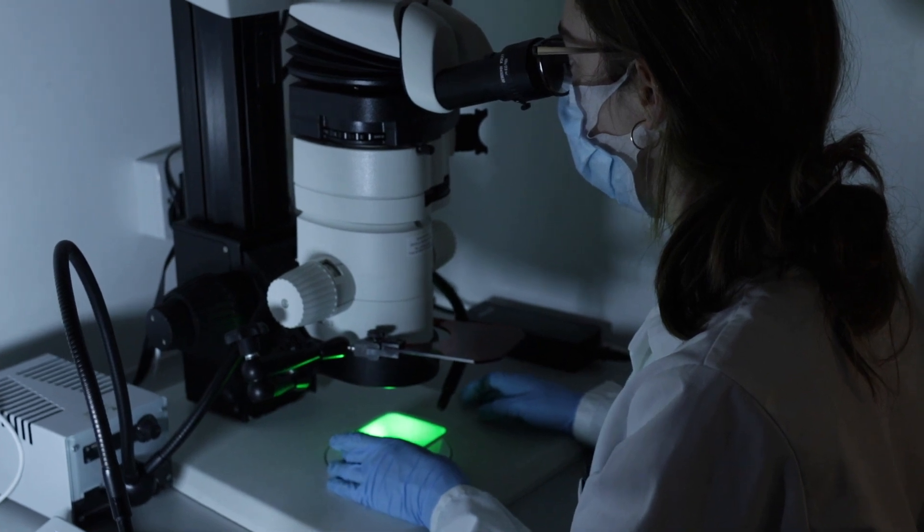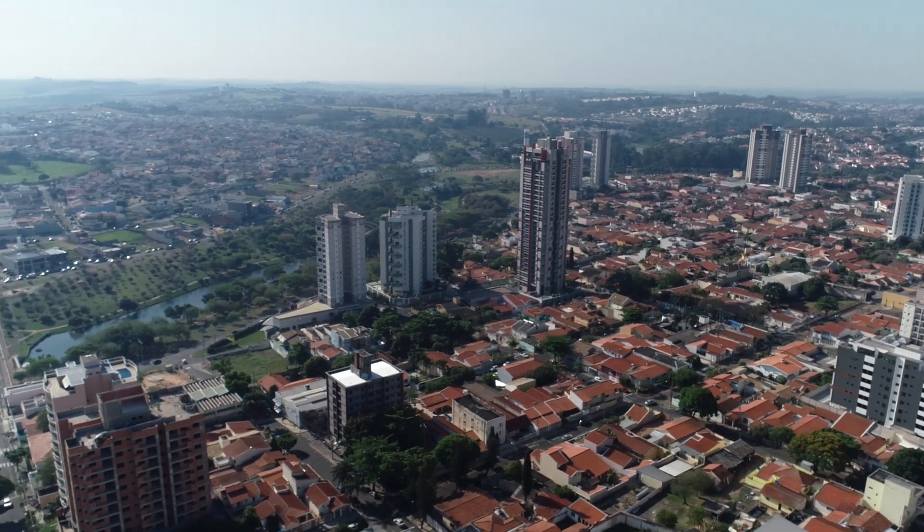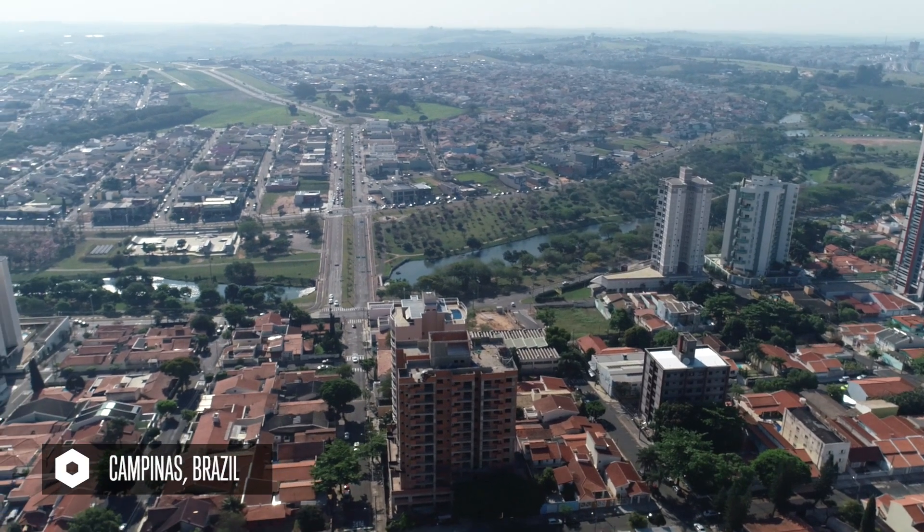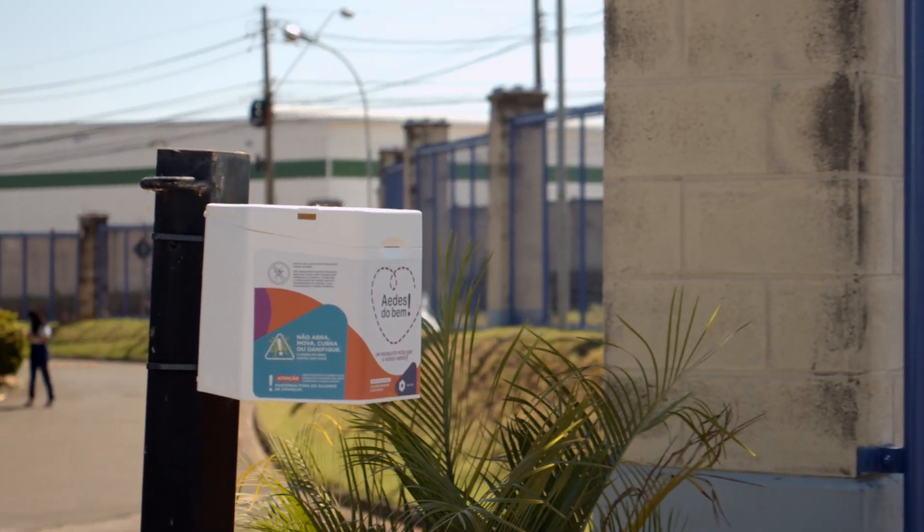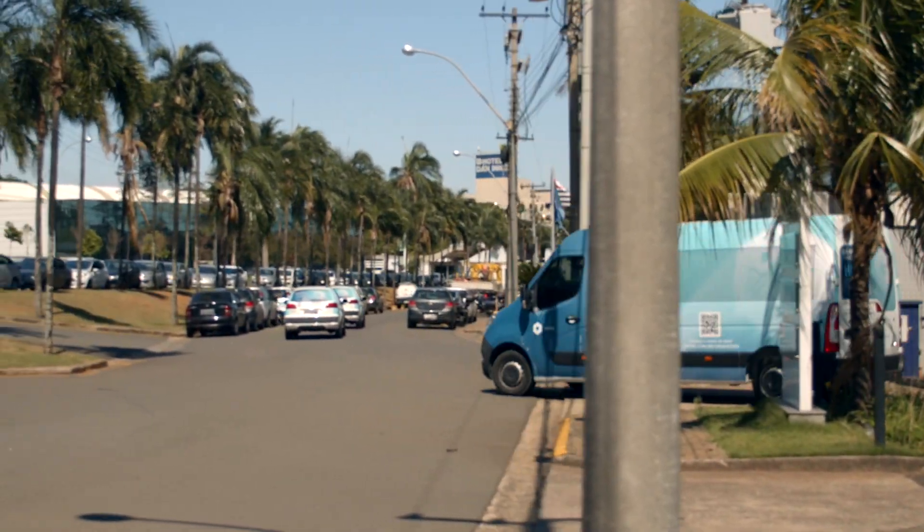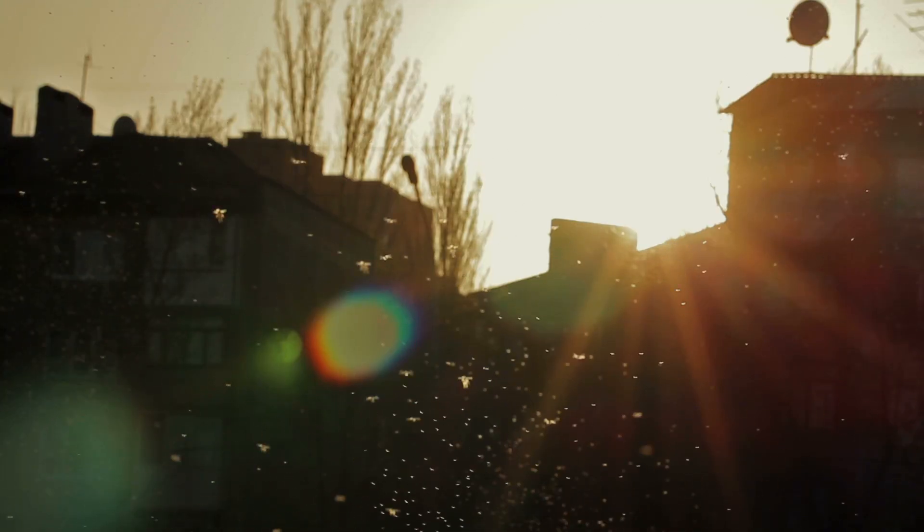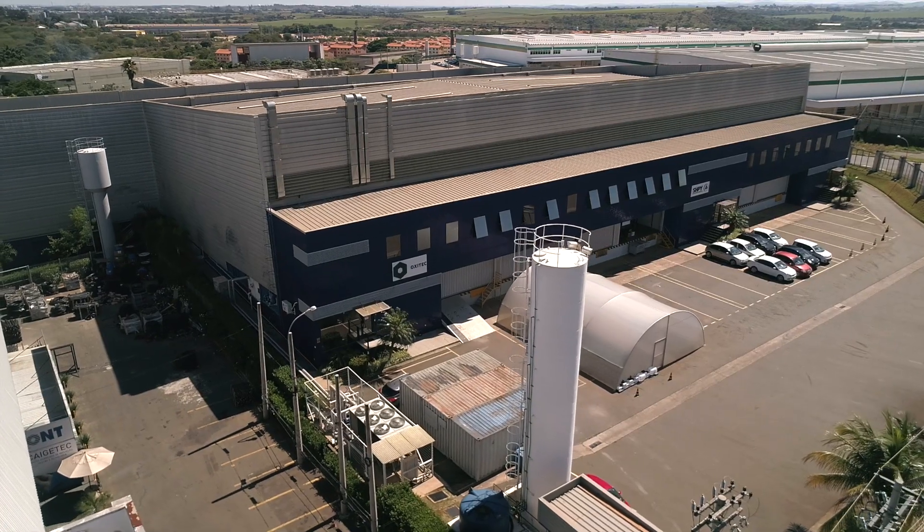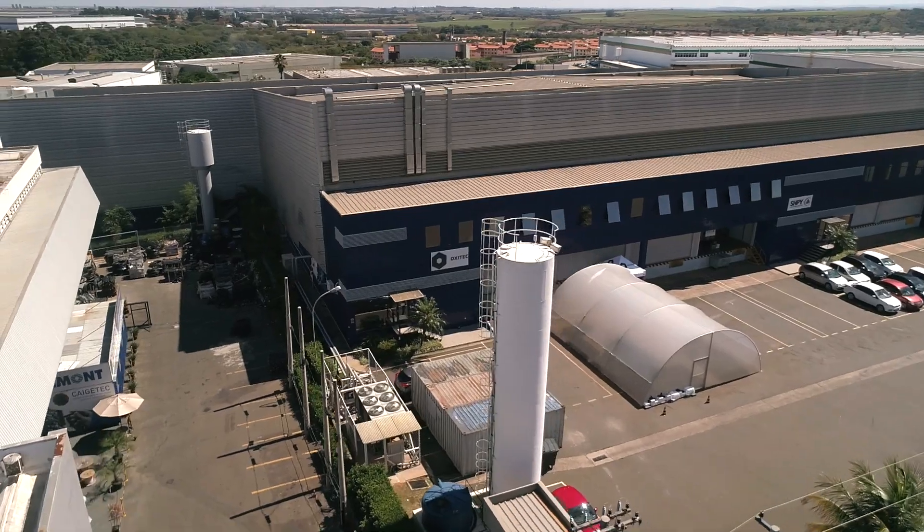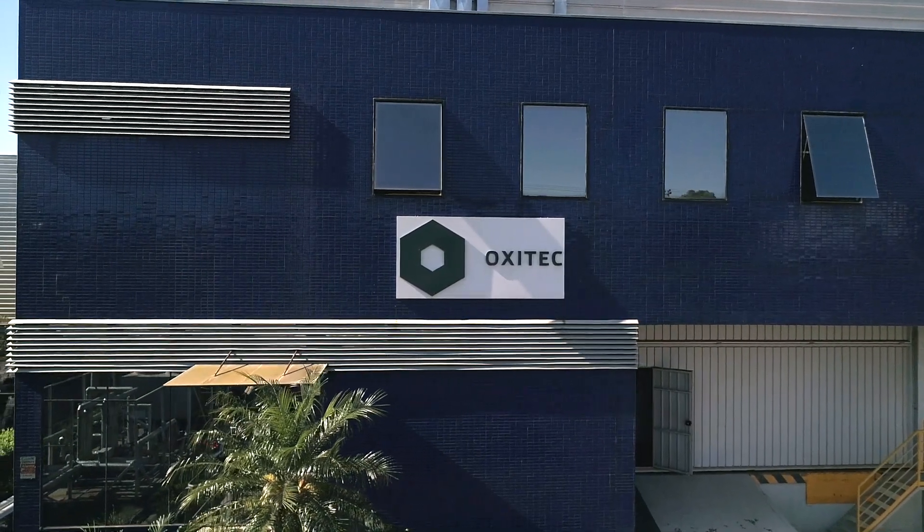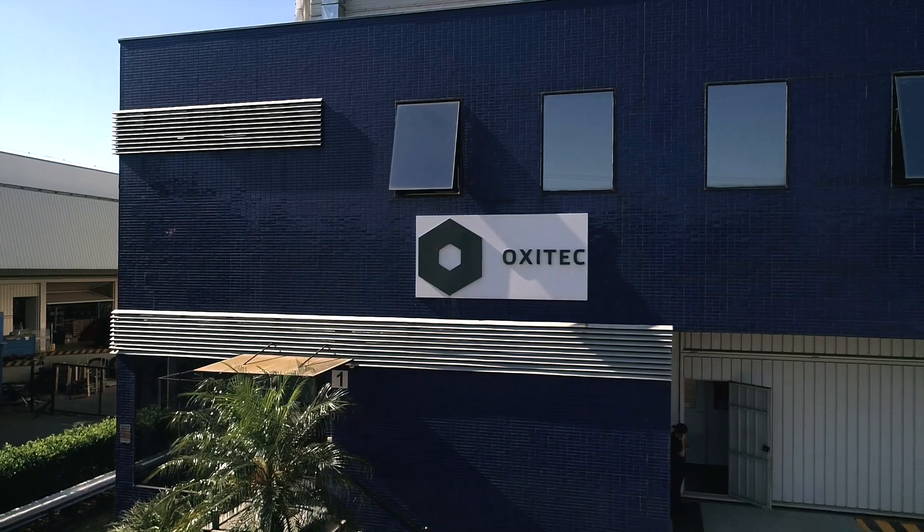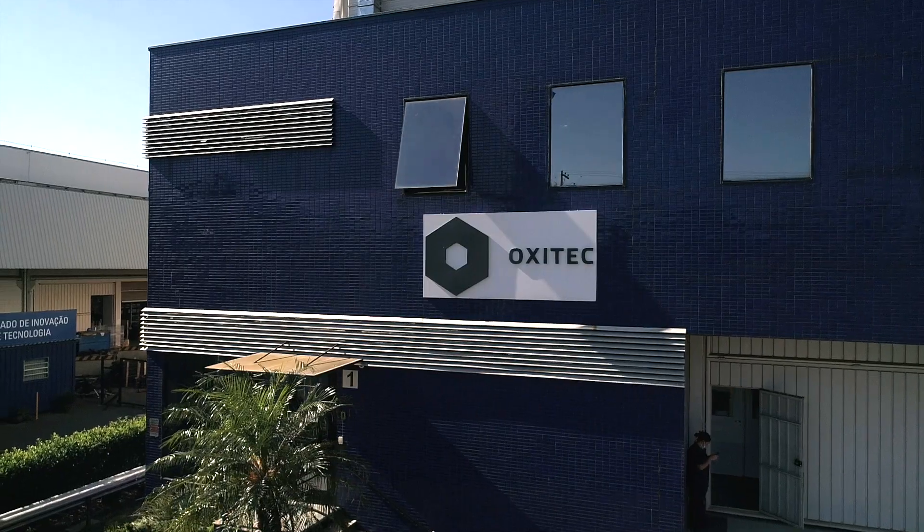When the strain is ready, the eggs are shipped to the location where they will be deployed. We have been successfully releasing our friendly mosquitoes in Brazil since 2009, with projects in several areas reducing the invasive mosquito population by up to 95% compared to the control areas that were not treated with our mosquitoes. Our large state-of-the-art facility, based in Campinas, was set up in 2016 to accommodate Oxitec's R&D programs, field deployment, and field monitoring of Oxitec's friendly mosquitoes.